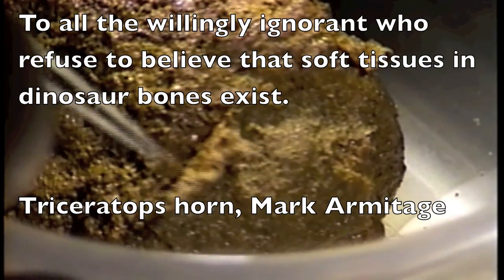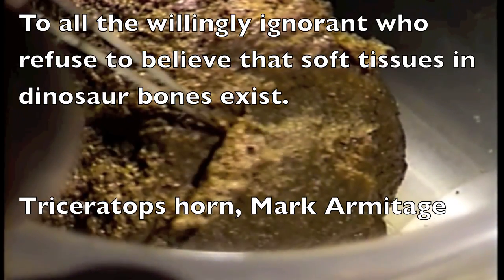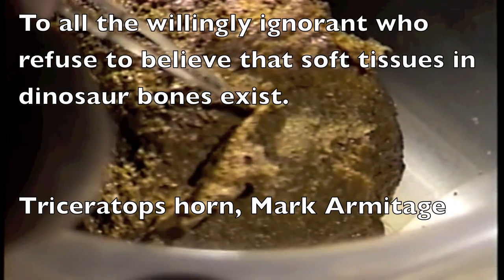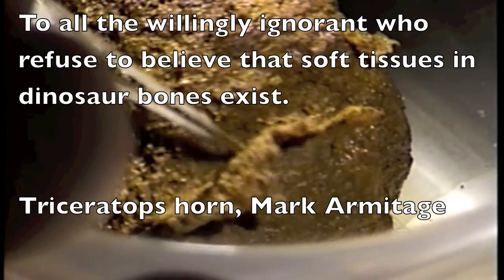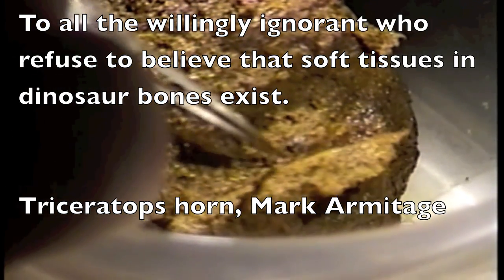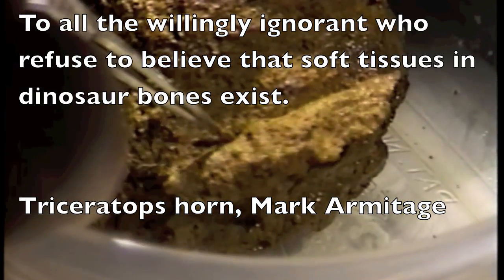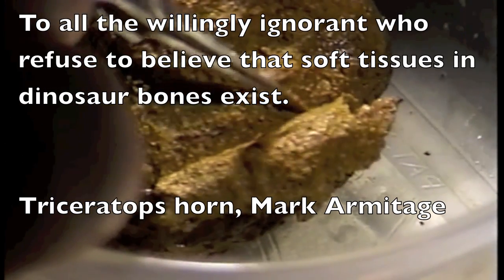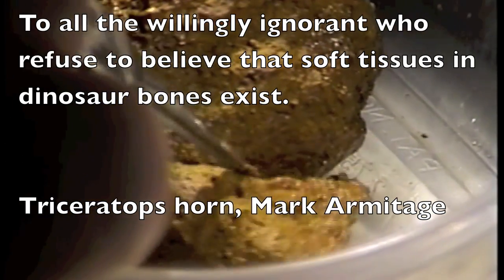Here is the bottom part of that same piece from the horn, and you see me peeling the bottom piece of this soft fibrillar bone tissue. Somebody has said, 'You just put up a video of a dirt clod — that's just a dirt clod. Who knows what you're peeling off there, maybe a piece of biofilm.' Look, I'm either a liar or I'm not a liar. You can call me a liar, but the bottom line is my work is published in an international journal for everyone to see.